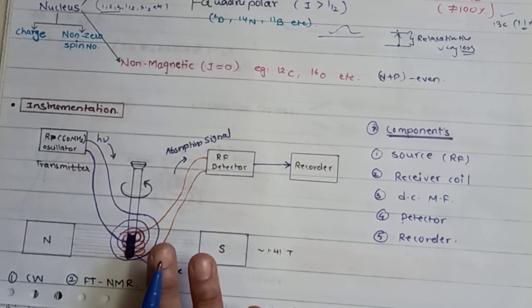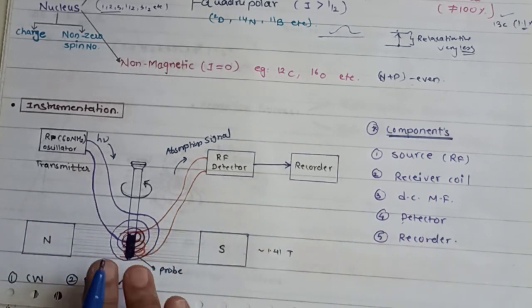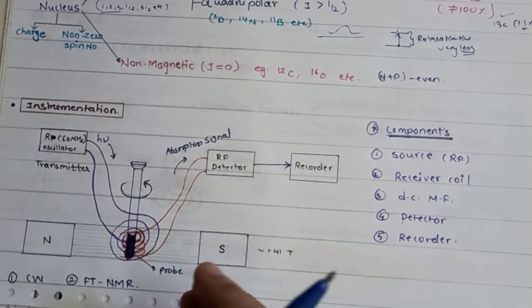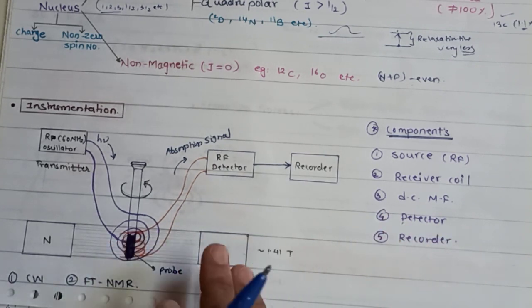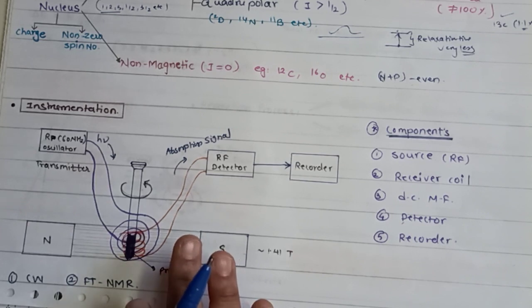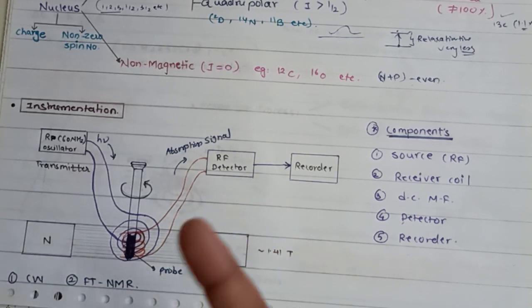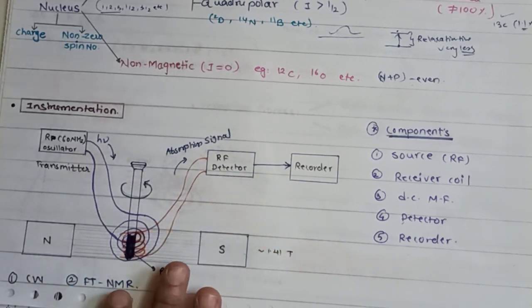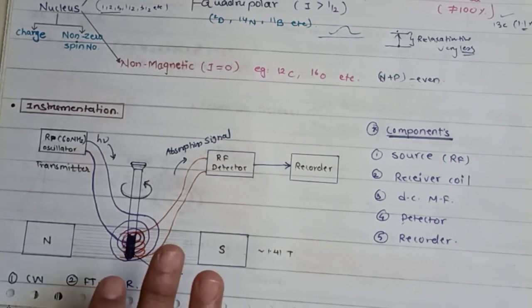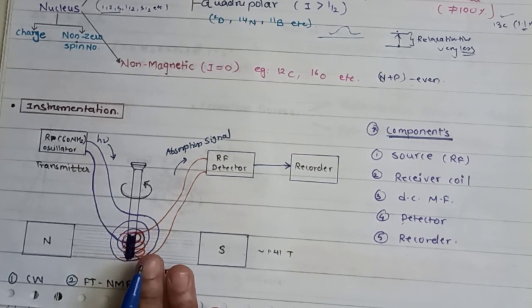So we must try to use individual ampoules rather than taking the solvent out of a bottle that is originally contaminated, of 50 to 100 gram of the solvent. So apart from the deuterium solvent, we use deuterium chloroform. Okay, but that should not be more than 6 months old, because if it is more than 6 months old, it may be acidic and again it will exchange with your labile protons. So to avoid those conditions, we use the pure deuterium solvent which is completely fresh.